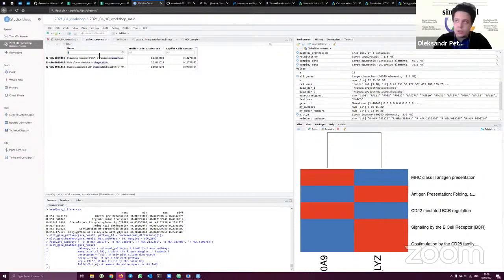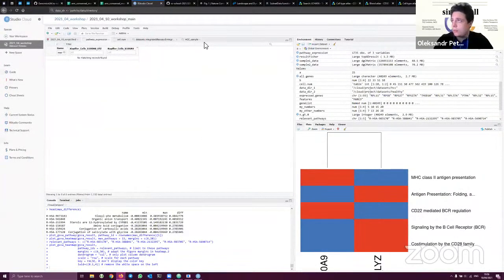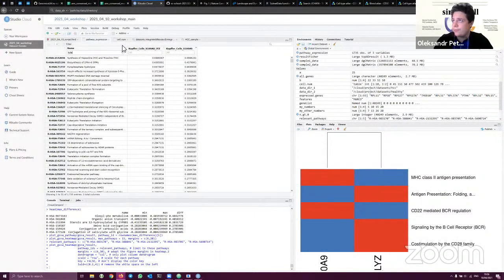So the pathways I can think about are not actually that differently expressed in these cells, either because we cannot calculate it adequately for the small cell population, or because they're so similar. Maybe it was inflammasome already. I just cannot think of any good example to show you.